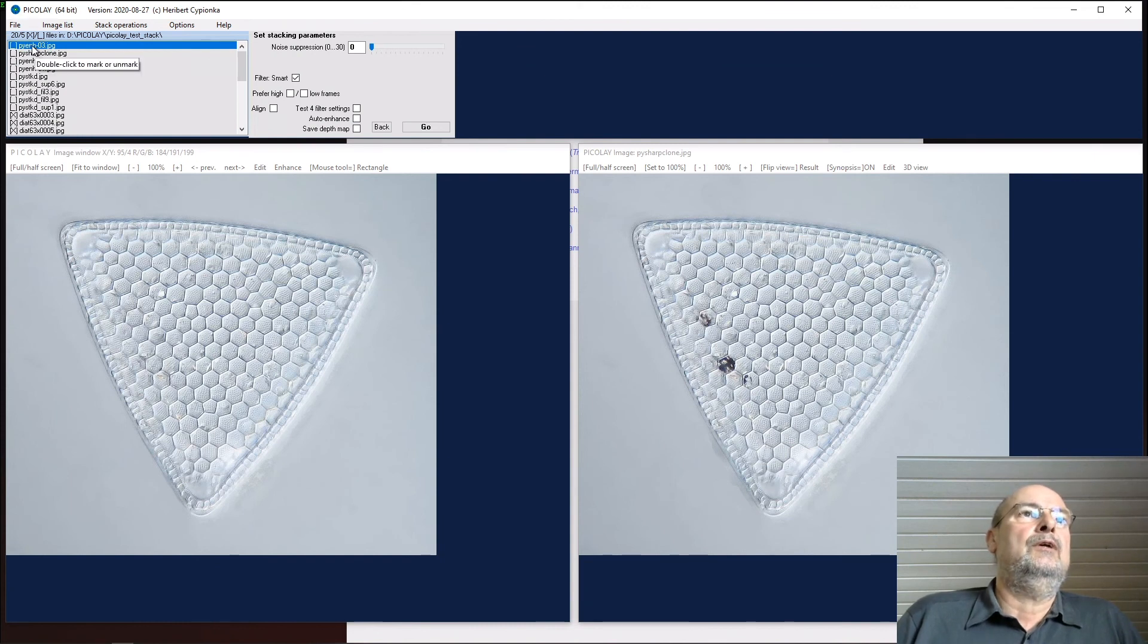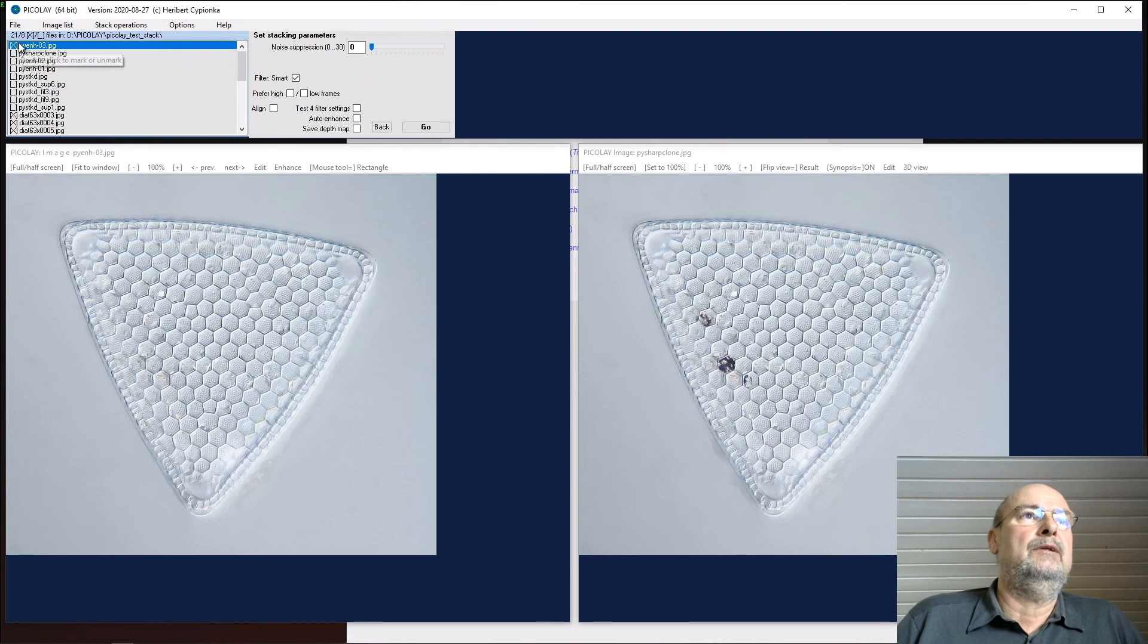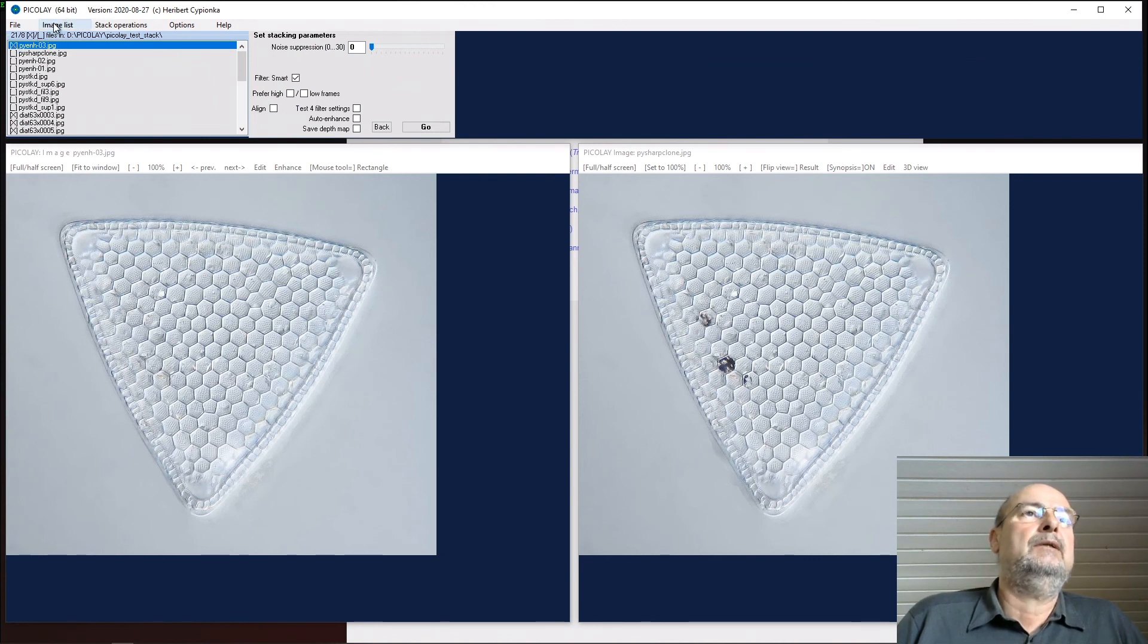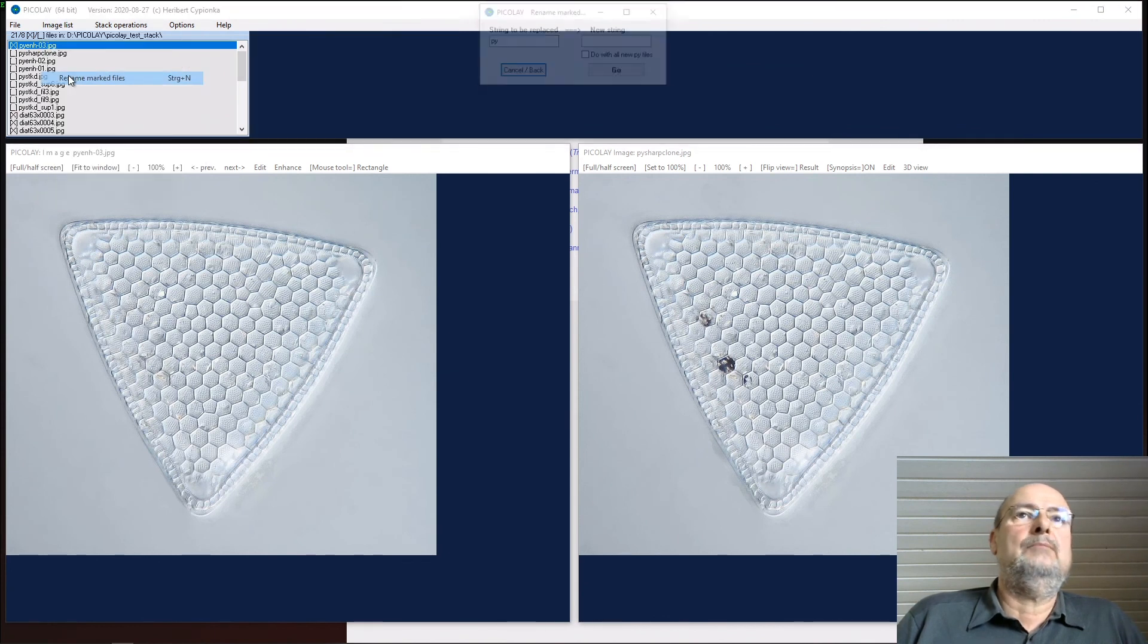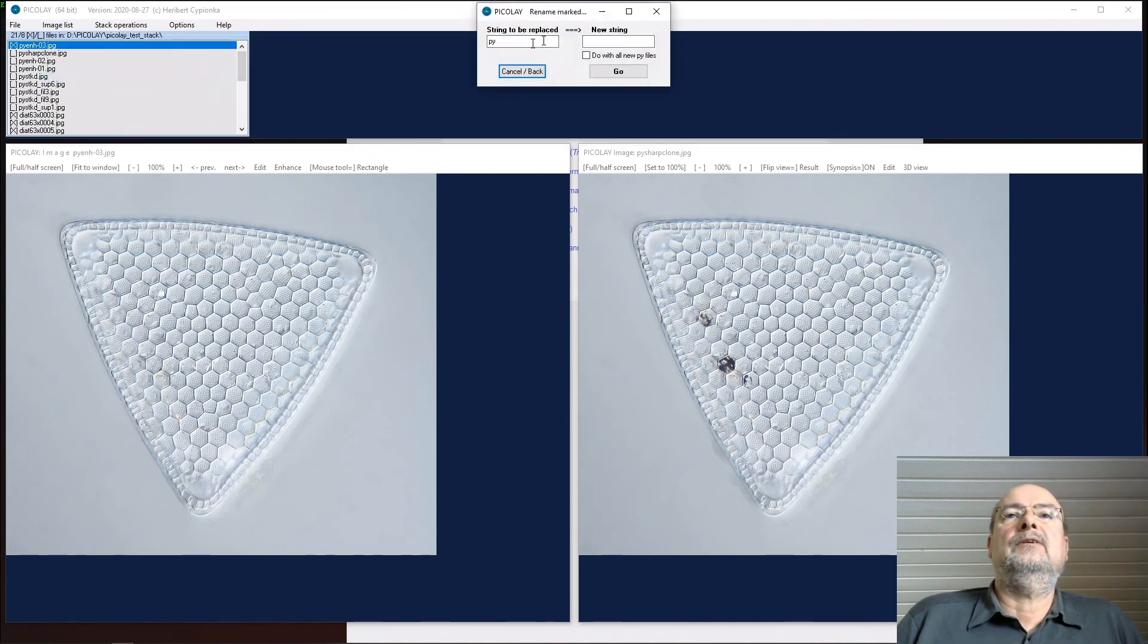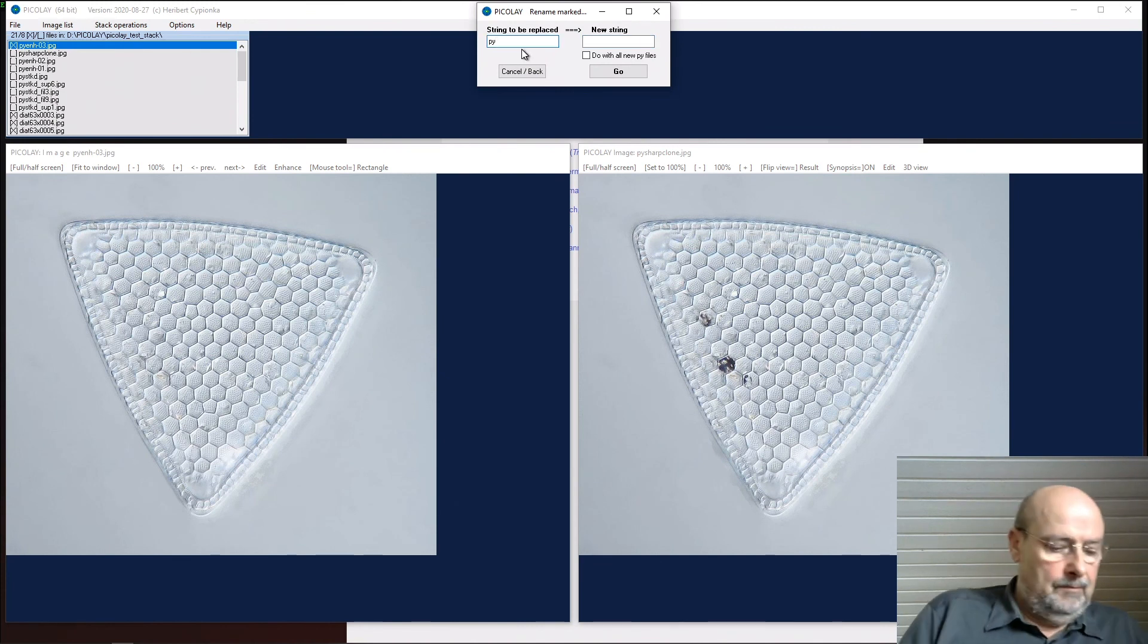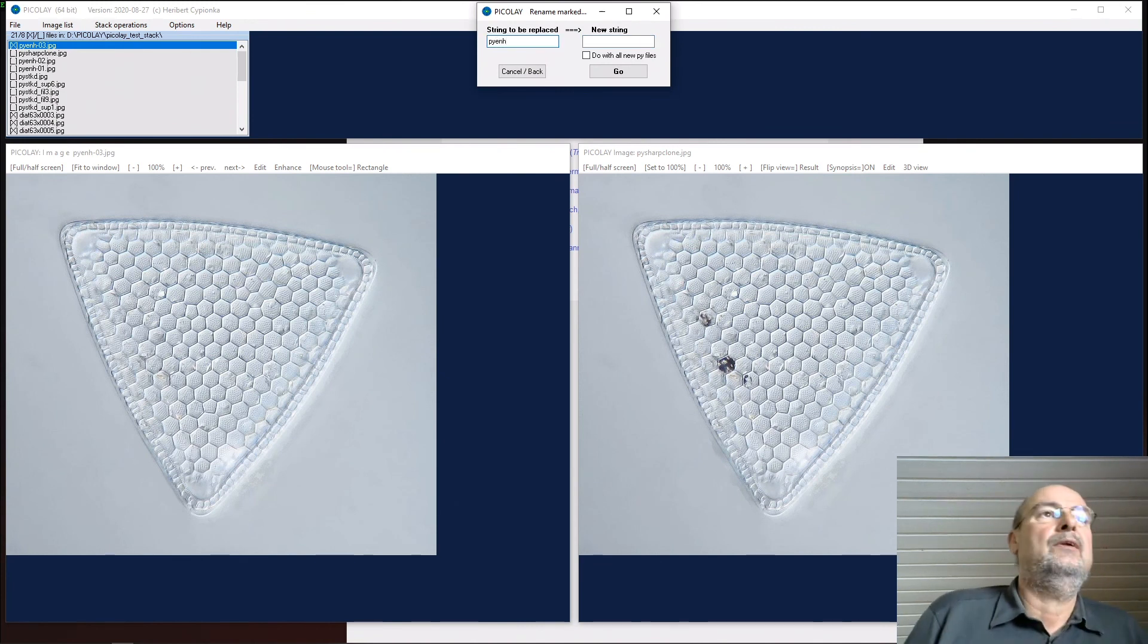Would say click here. Double-click to give it a name - sorry, to make it marked. And now we would say image list, rename marked file, and would say rename Picolet enhanced.